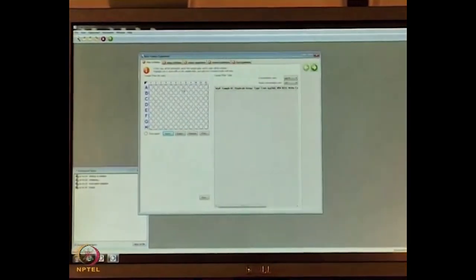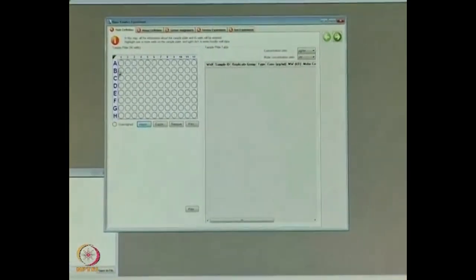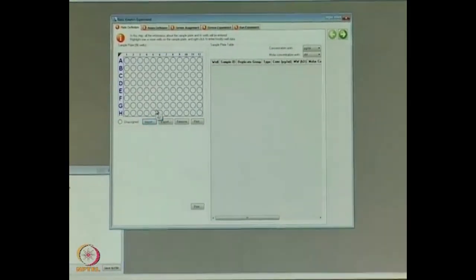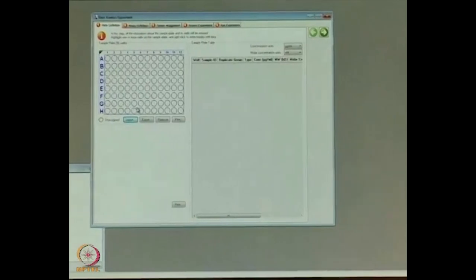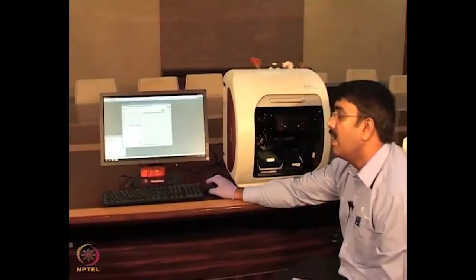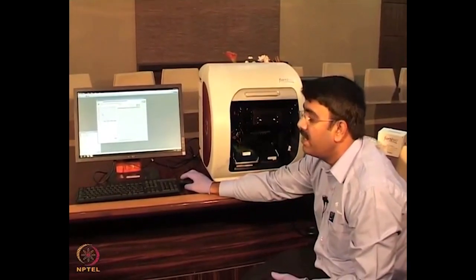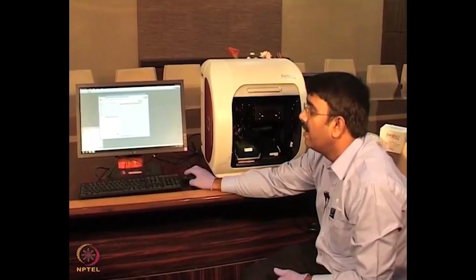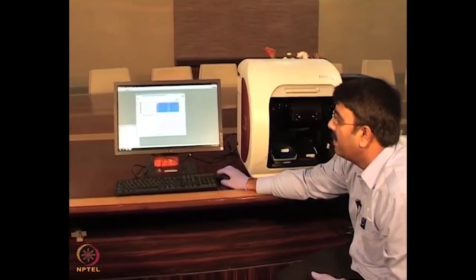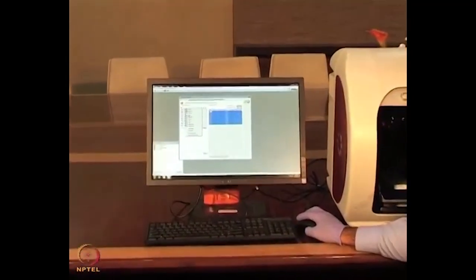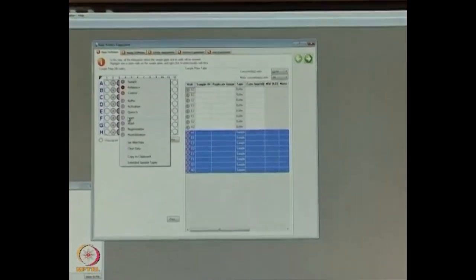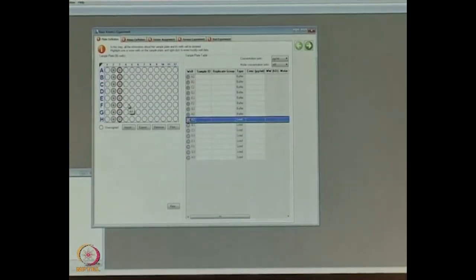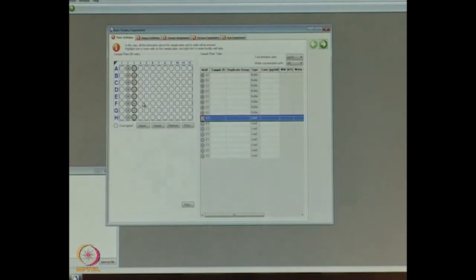A page opens up. On the left-hand side there is a 96-well plate design — this is what we call the plate design. We have to mention in the plate design what things we have put in each well. I have mentioned the biotinylated ligand, buffers, as well as the two-fold dilutions of the mouse monoclonal antibody. We need to specify where all these things are placed in the 96-well plate. In the first column I put buffer.